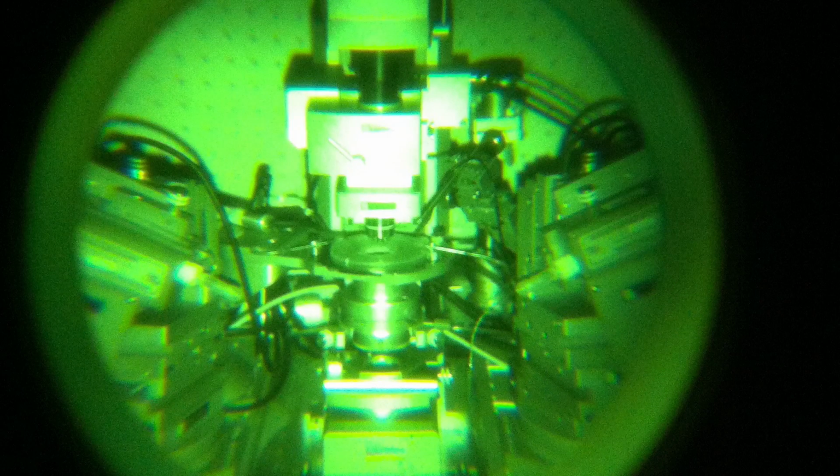And while this is done in confocal microscopy in many other parts of the brain, we study functional light responses in the dark. So confocal microscopy is not feasible to do this in the retina. We bleach all the photoreceptors and there's no light response anymore. So we need to do this under infrared illumination, two-photon, to be able to target our cells. So that's what we do every day to be able to find specific cell types.